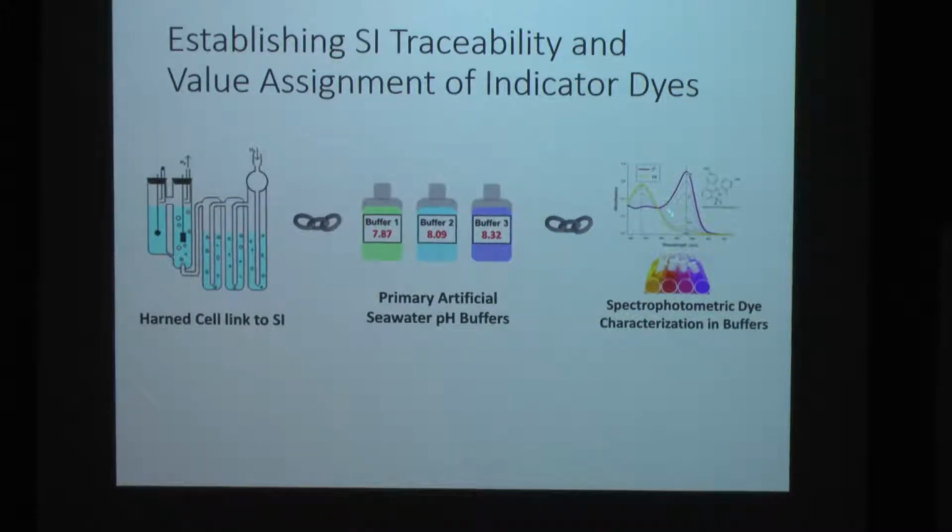make this effort worthwhile by using a high purity compound. You could use a lower purity compound, but then it's subject to higher uncertainty because you may have changes in composition over the whole batch, for example. Or there may be lower stability with time if some of the impurities degrade with time.